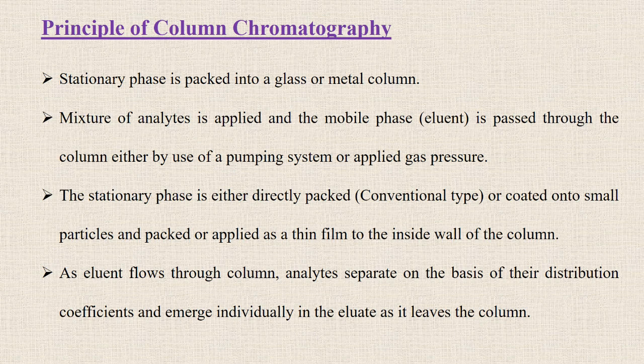The principle: stationary phase is packed into a glass or metal column. Then the mixture of analytes, the mixture to be separated, is applied, and the mobile phase is passed through the column. Mobile phase is either pumped through by using a pumping system or by using gas pressure. The stationary phase is directly packed, or it can be coated onto some particles and packed, or it can be coated as a thin film on the wall of the column.